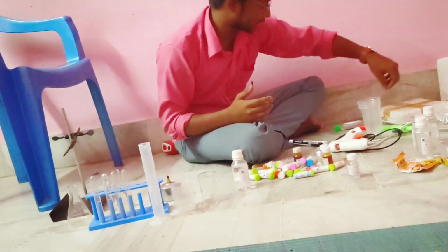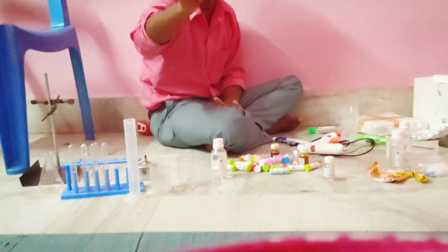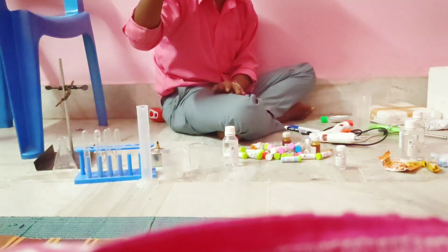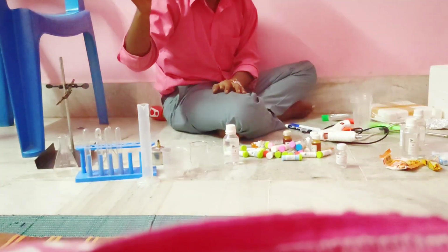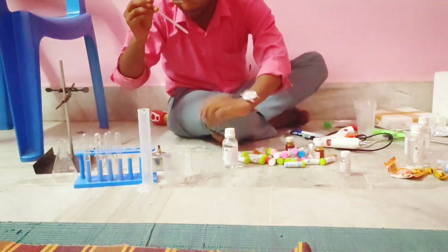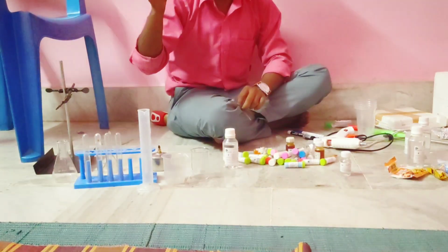And you cannot use such kind of dropper. It is made with plastic. Even if you burn that, it will melt that. Concentrated HCl has the power to melt that. So we have to use that kind of dropper, which is made with glass. To take some amount of concentrated HCl, we cannot use a plastic dropper. We have to use a glass dropper, which is made with glass.